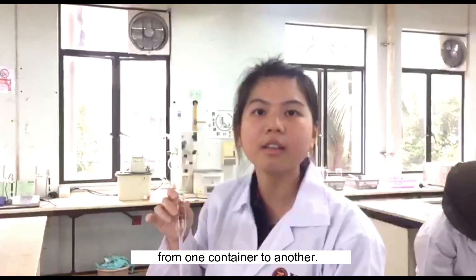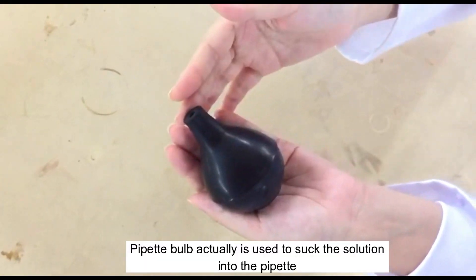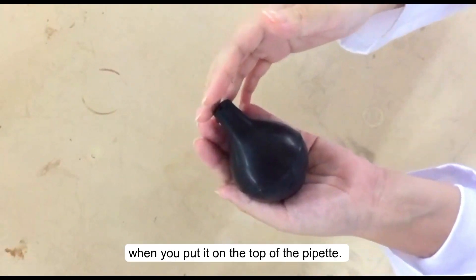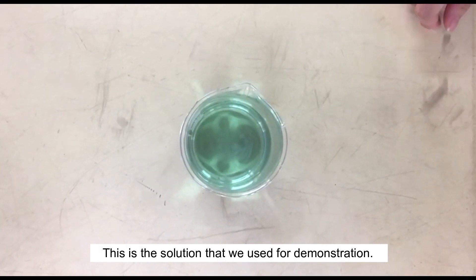A pipette is used to transfer a specific volume of liquid from one container to another. This is the pipette bulb. The pipette bulb is used to suck the solution into the pipette when you place it on the top of the pipette. This is the solution that we will use for the demonstration.